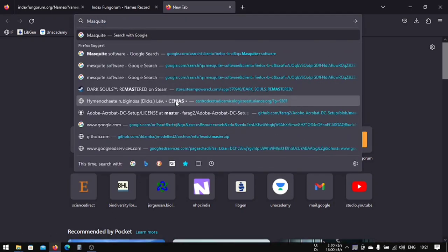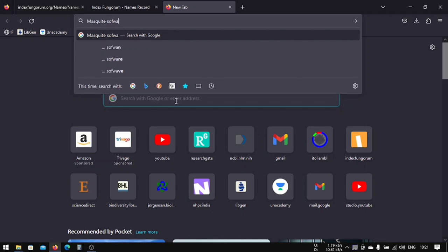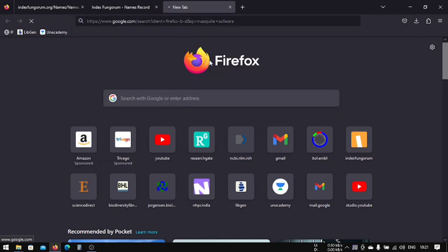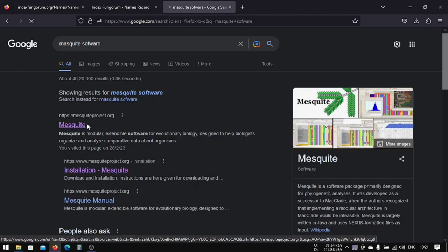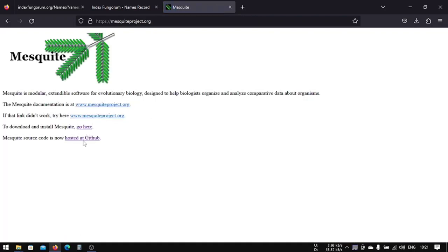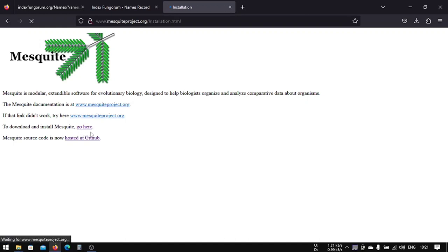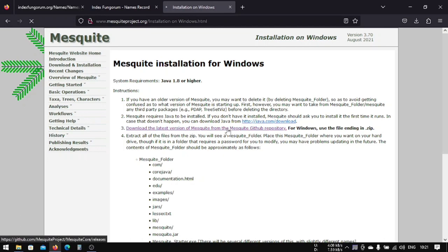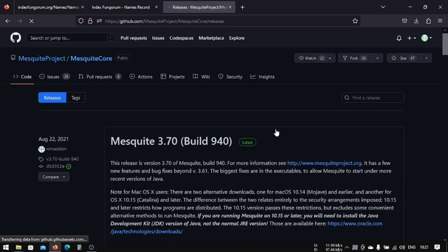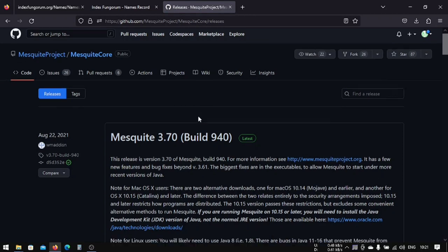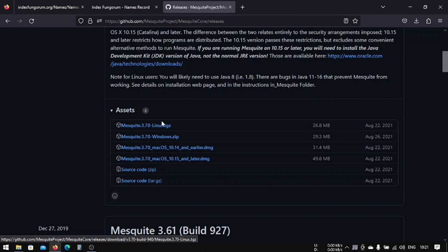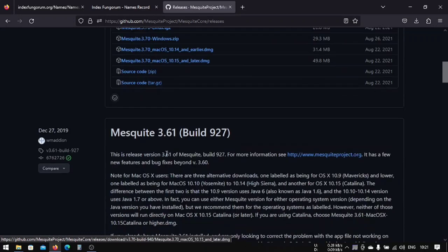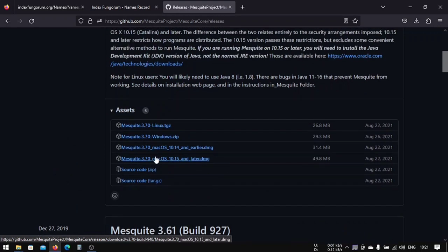You have to download this Mesquite software. You can download it from this website, mesquiteproject.org. Go here to Windows, download the latest version of Mesquite from the GitHub repository. You have to download this Windows zip. If you're using Linux, you can also download this, or on Mac, these are the versions that Mac uses.